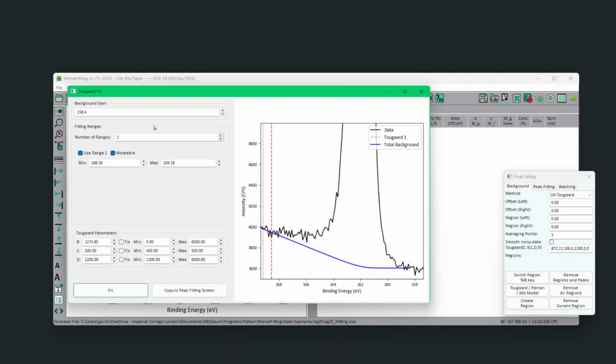We could also change the starting range, so you see where it started there. Maybe we will start somewhere around here, so let's fit again, and maybe further down. Yeah, and further down, one more. That's it, something like that. So now this is good.